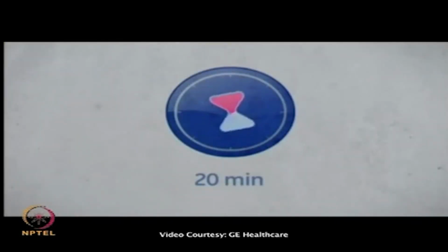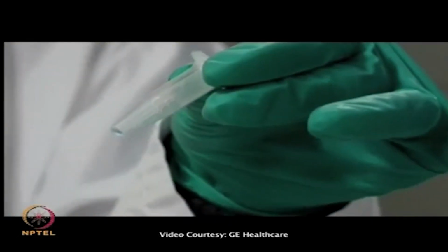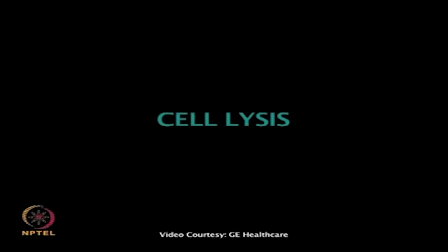The cells are incubated with Cy-dye DIGE fluor minimal dyes for 20 minutes on ice in the dark. After the labeling reaction, the unreacted dye is quenched by adding 20 microliters of 10 millimolar lysine. The labeled cells are now washed twice in cold HBSS pH 7.4 buffer to remove the excess Cy-dye. There will therefore be no free dye left for unwanted intracellular labeling of proteins in the next step, which is cell lysis.